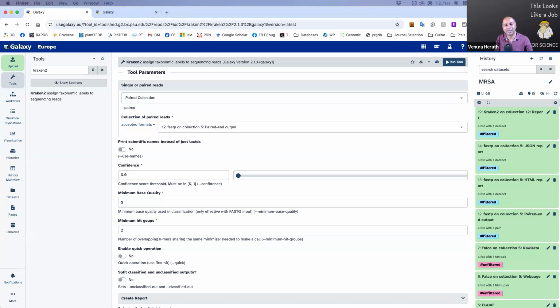With the help of these kinds of tools, we can go beyond the scope of our studies. But there are different processing steps in sequencing, especially when we make libraries, where we have different targets. Depending on that, it will decide whether we are going to look at multiple species or a single species.